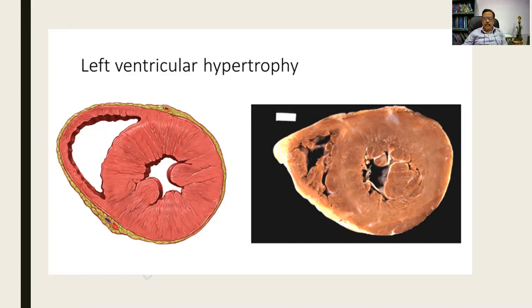In your examination, you are supposed to measure the walls of the specimen, the diameter of the lumen, the wall of the right ventricle as well, and the lumen. Now look at this. It is a specimen from an autopsy, and I find that the right ventricle is over here, the left ventricle lumen is narrowed and it is markedly thickened. Again, an example of a concentric hypertrophy. So you will not be wrong if you say it is an autopsy specimen, because no man will be alive after the heart is removed.